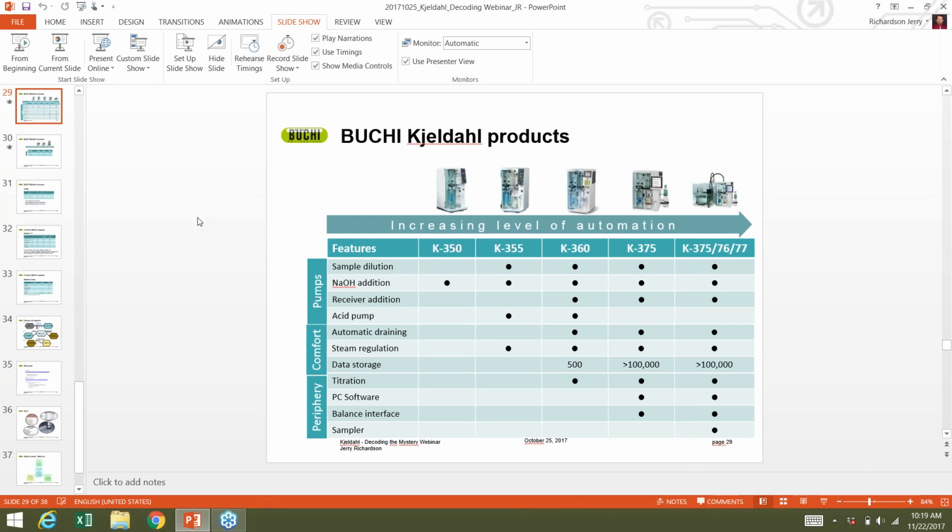Okay, so how often should we replace the digestion vessels? All right, again, my recommendation there is to inspect them. Realistically, given the thickness of the glass, they should last you an awfully long time, probably in the neighborhood of years, like 2, 2.5, 3, somewhere around there. And again, that depends on how many times you run. But ultimately, what you need to do is inspect them for a star crack of some sort and or wear and or etching on the glass at the lip where it would connect to the bung. If you see an etching on the glass, that basically means you could be losing ammonia. So basically just inspect, but quite frankly, they should last you quite some time.